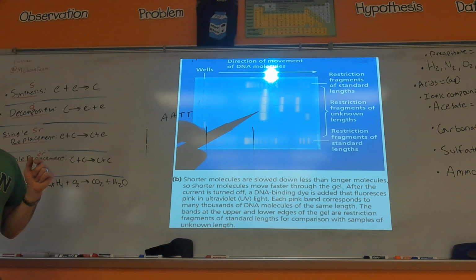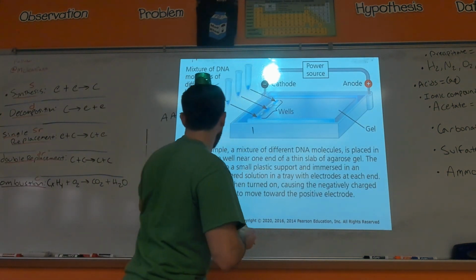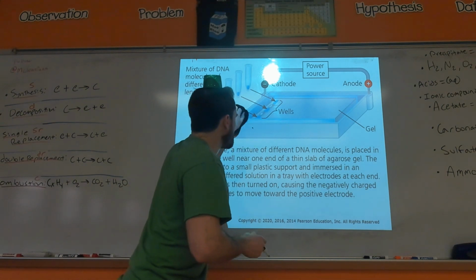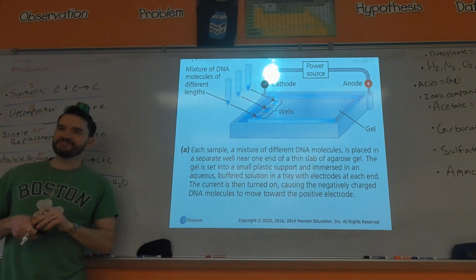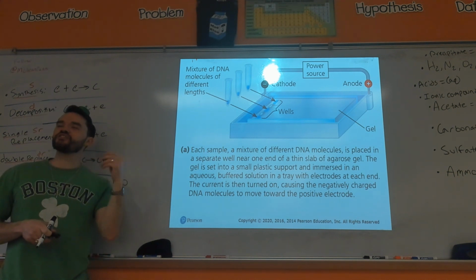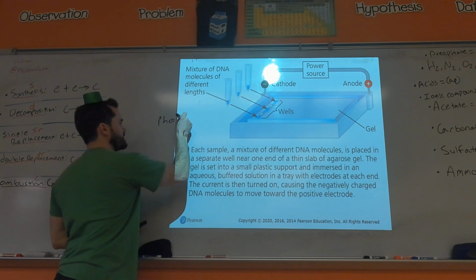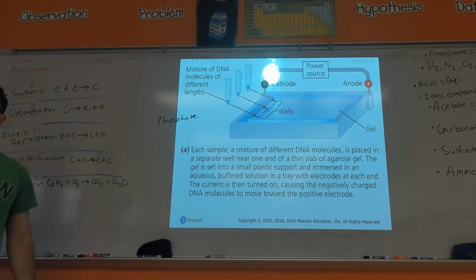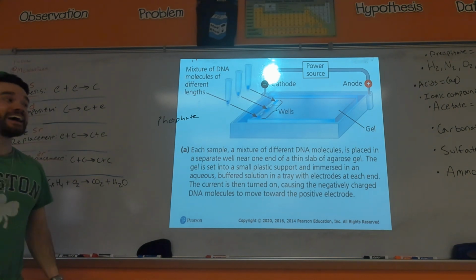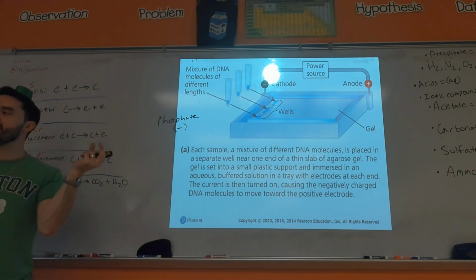Okay. So going back to how exactly the gel works and separates it, you need to remember that DNA has what charge on it? Think of the sugar phosphate backbone. So phosphate, anybody know what charge phosphate would have? Virginia? I was just going to say the DNA is negative. Yeah, it's negative because that sugar phosphate backbone has a negative charge.